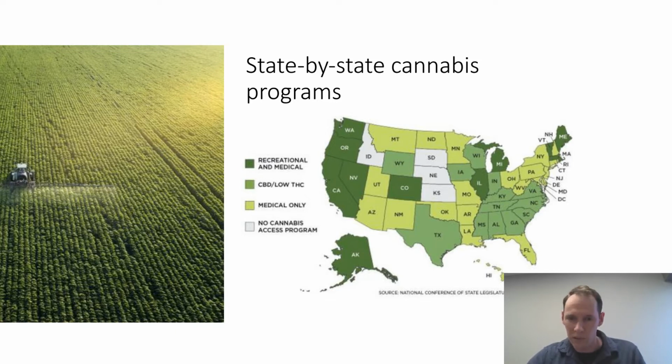And I just wanted to highlight the medical cannabis market in particular and do a quick comparison of the different state pesticide testing rules and kind of highlight the issue that there is with the lack of harmonization between these states and their pesticide rules.